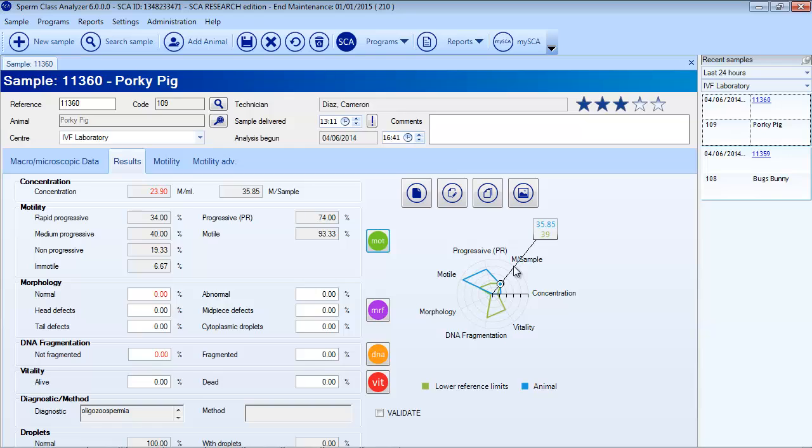Furthermore, it is possible to read the sample and obtain several reports among other options.